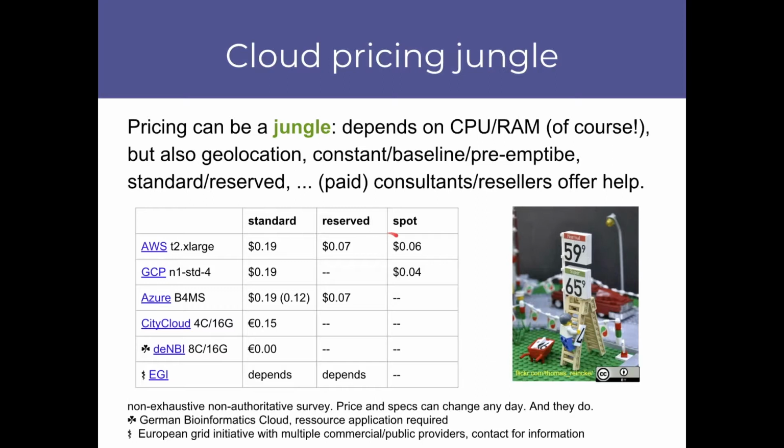There are other instances from some of the providers that are spot instances, and they are preemptible. That means if the cloud provider needs more compute power, they simply kill your virtual machine without any notice and give it to somebody else. Now that sounds like a nightmare, and we are not supporting that right now in Phenomenal.